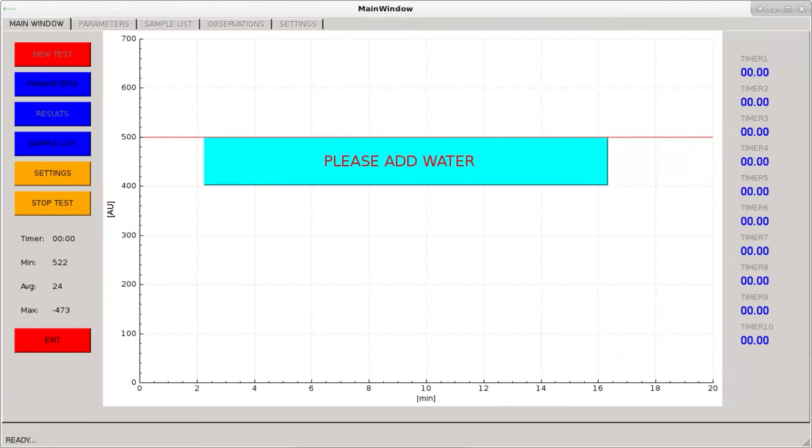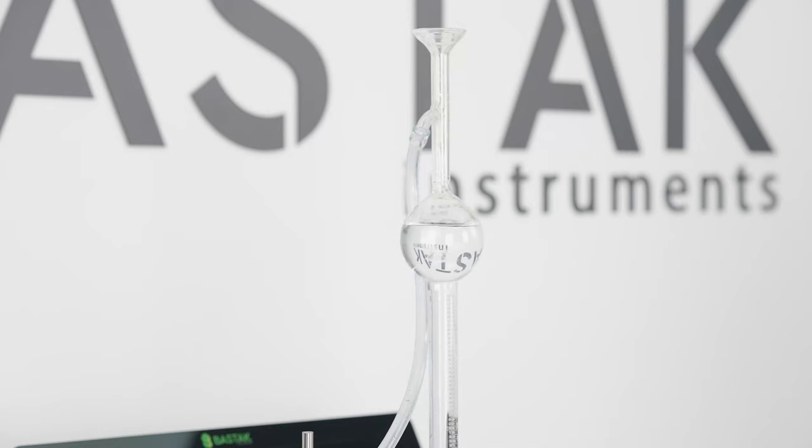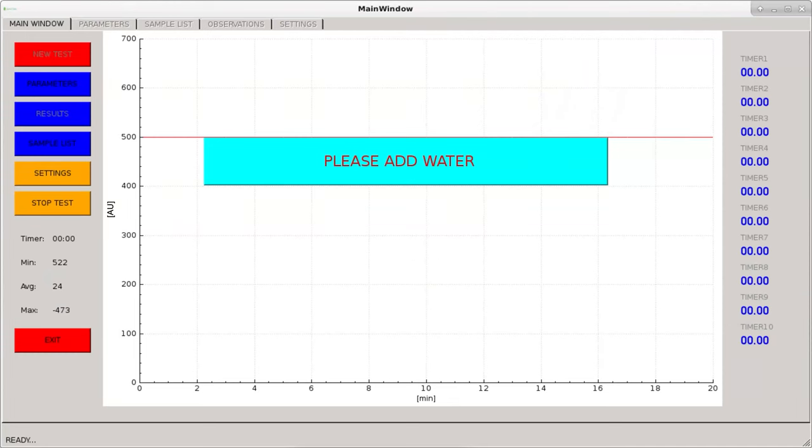At the end of the homogenization time, the warning 'please add water' is displayed. The 30-degree pure water previously transferred to the burette is poured over the flour sample in the kneading chamber. The please add water warning disappears and the graph starts to be created.